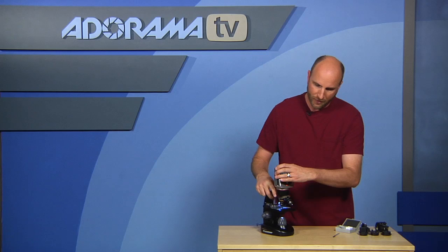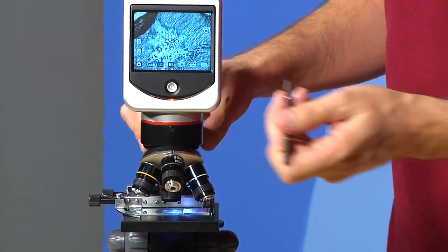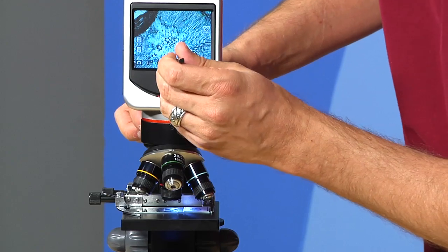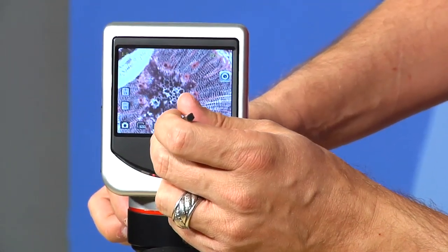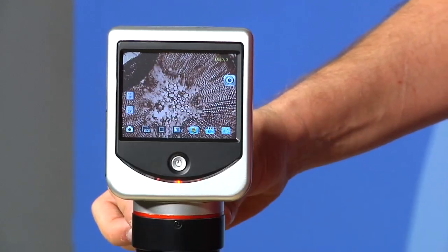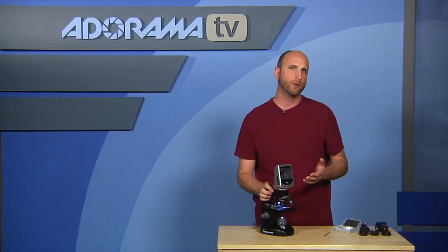There are also digital controls to change the color so you can get higher contrast images — using sepia, black and white, or other options — just by clicking. That way you can change how the image looks and maybe get a nicer view of what's in there.